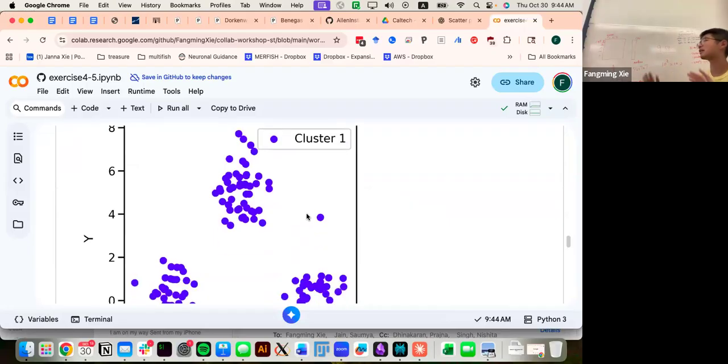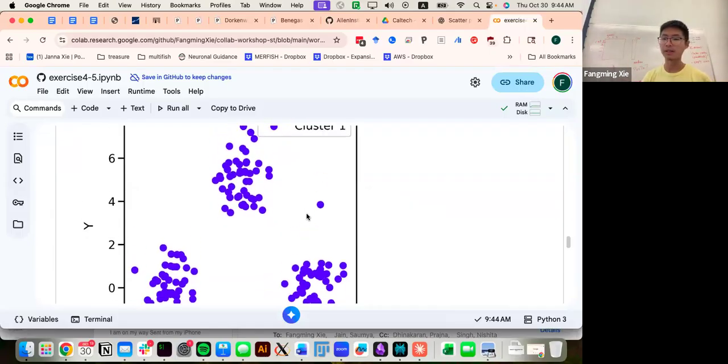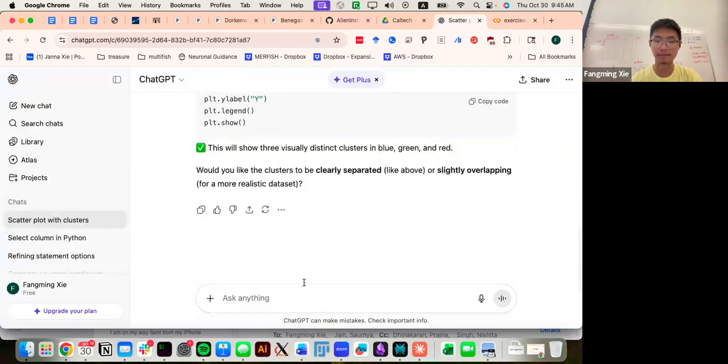Initially we just have three groups of cells. We don't know there are 3 groups of cells. We just got some cells, but by eye, intuitively, we think there should be 3 clusters. So let's apply k-means with k equals 3 and see if k-means identifies those clusters.